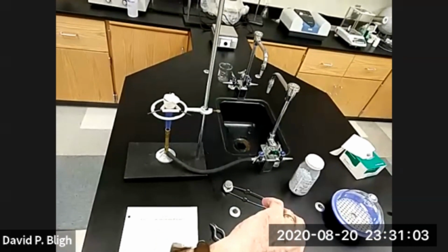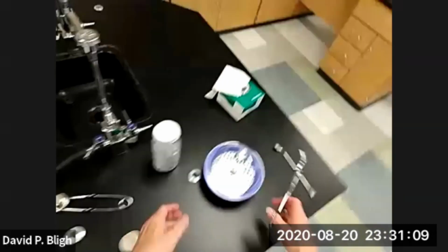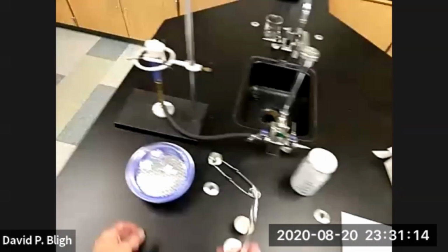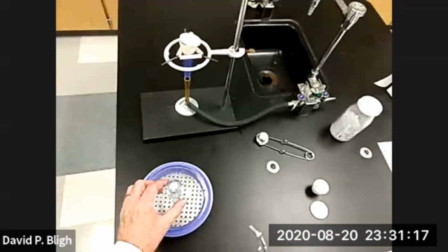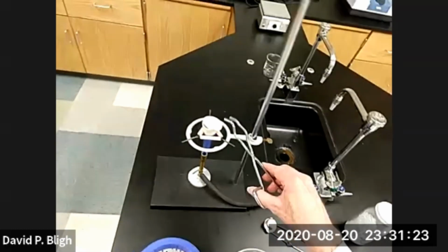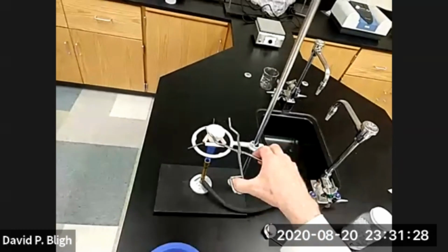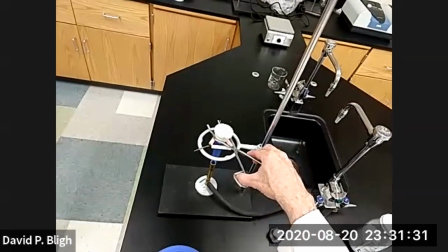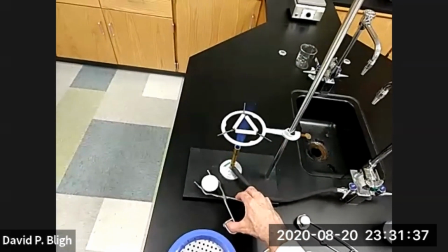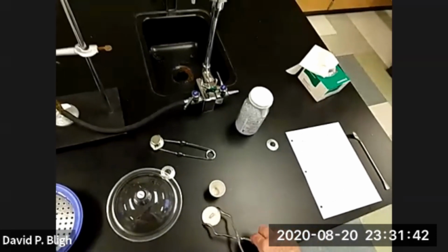Okay. In the interest of time, I'm going to call this one done and move our crucible over here and our combustibles away from the flame. We don't want to get too close with the plastic. All right. So let's take this one and move it. We're supposed to let it cool for a couple of minutes. Let's do that. And while it's cooling, it won't be cool enough to absorb water.